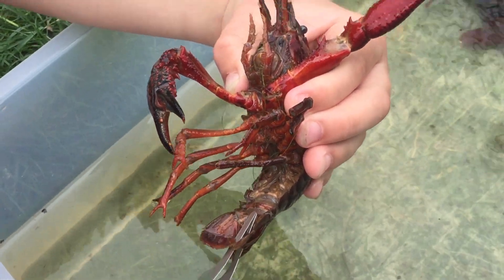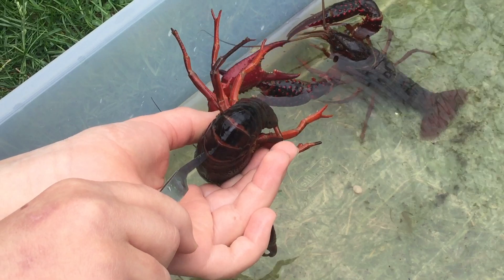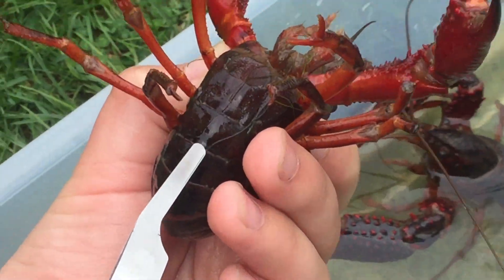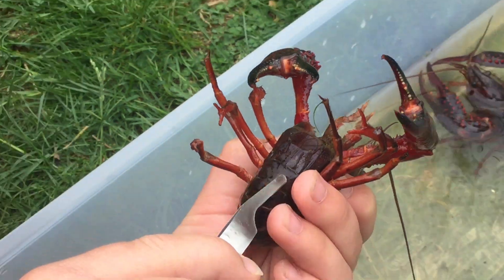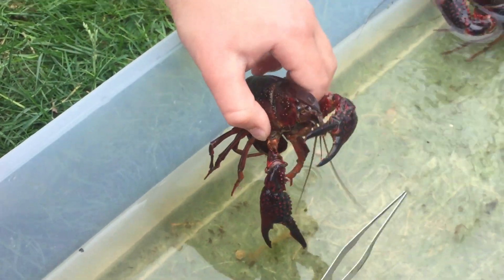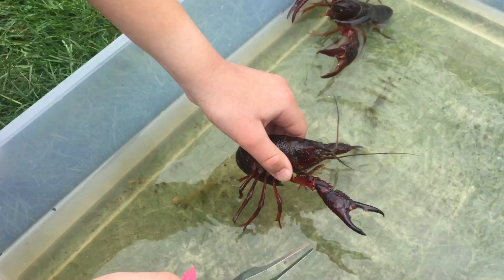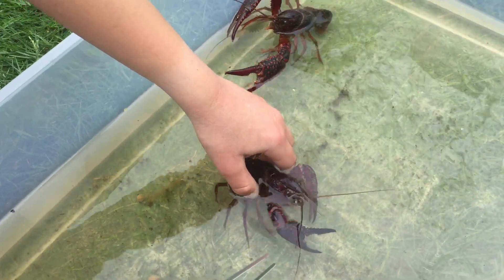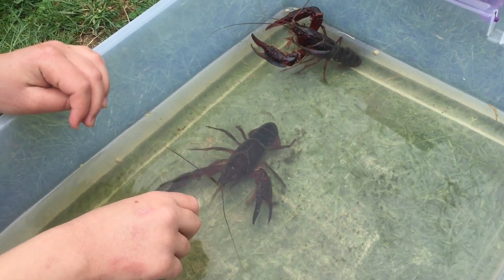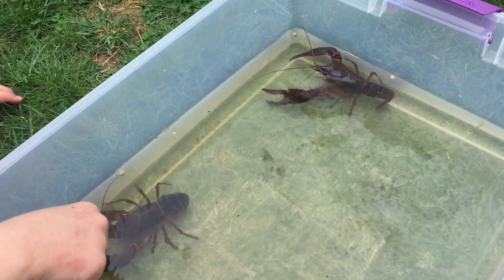Is that tail jointed? How many joints are in the tail? On the parts of the tail, there are lines that are probably the joints — one, two, three, four, five — and it looks like six if you count the last one. So six joints on the tail, which is also known as the abdomen. The crayfish can scoot backwards by really flexing its abdomen — curling it underneath. There are huge muscles in that abdomen, that tail. That's what we eat when we eat lobster tail. Crayfish are basically the freshwater equivalent of lobster, which lives in the ocean.